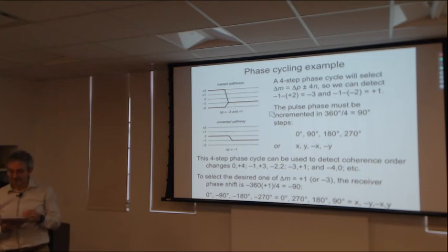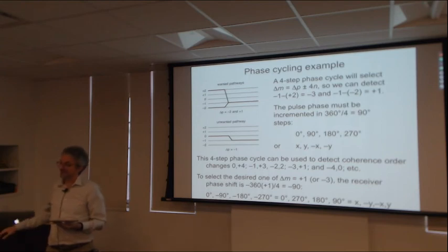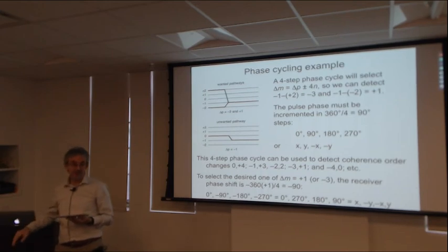designed for your experiment. Now, if we have many, many pulses, you quickly get very, very long pulse sequences. Because if you have 3 pulses, and each one needs to be cycled in steps of 4, then you need 64 steps if each is going to be cycled independently.